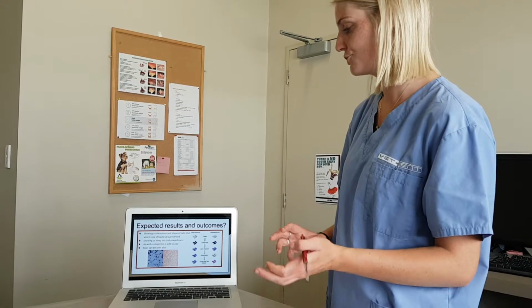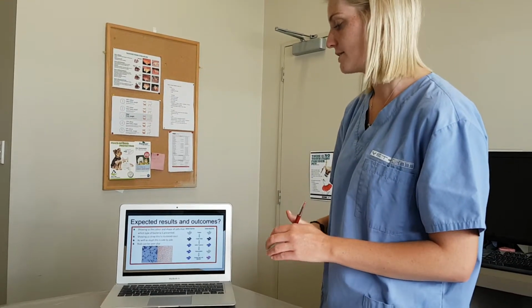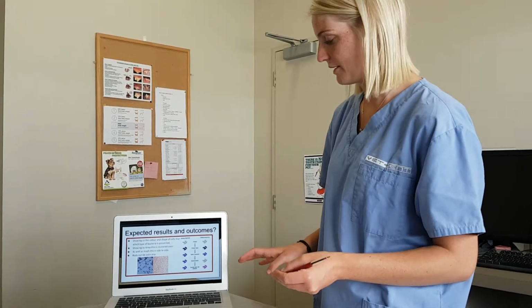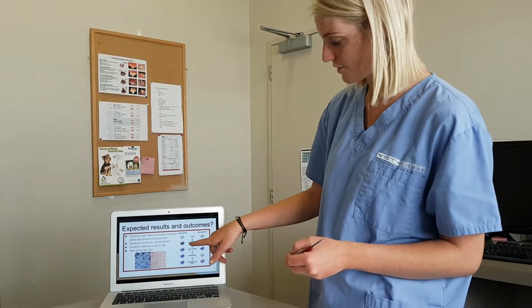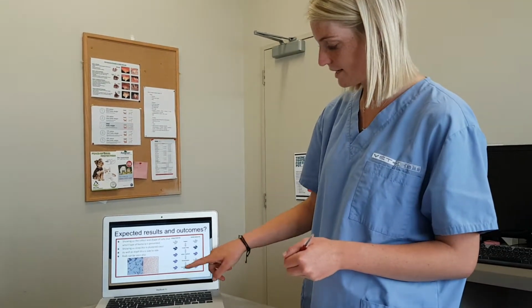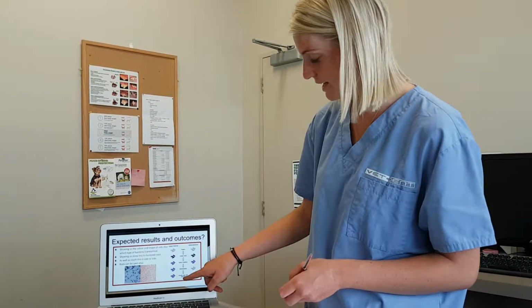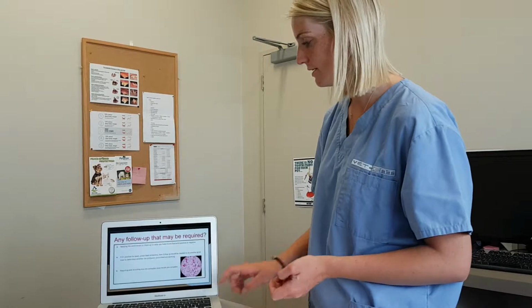So showing us strep that is clustered, as well as staph that is side to side, and rods, and so we've just got gram-negative, and what the colour, so crystal violet turns into this colour, iodine treatment, this colour, decolorization, which goes white, and then the safranin stain, which goes a pinkish purple colour.